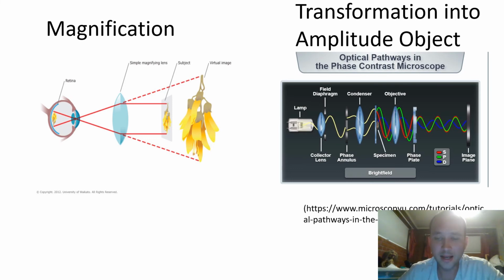When you add the dye to the bacteria, this causes the amplitude of the white light traveling through it to change in the different spectrums of the light. The different colors of the light will decrease in amplitude, which is brightness, differentially. So for gram-positive bacteria, the amplitude of blue light will be least affected compared to the rest of the spectrum, which then through our visualization will be perceived as staining blue.